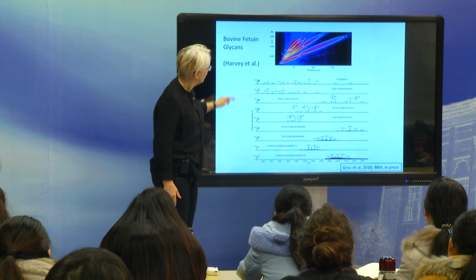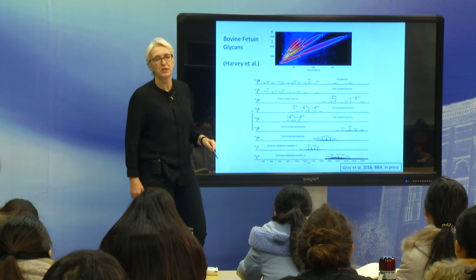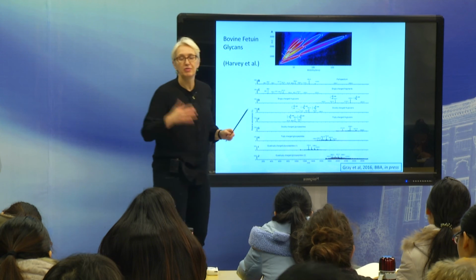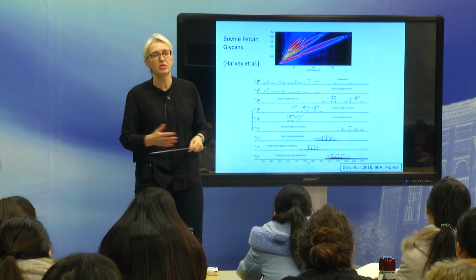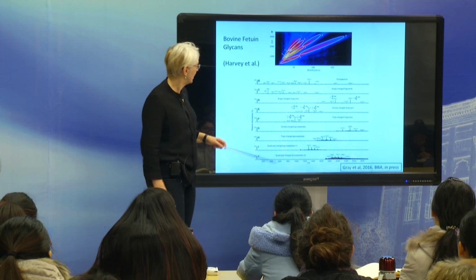And what he can show is that he can really pull out minor components, very importantly often also from polymeric materials. You might have polymeric material here, but your minor component might be up here, and you get very nice separation. So he, for example, says if you send samples and it's got a lot of polymer from some column or something, ion mobility is a very nice way of actually pulling out the active material.